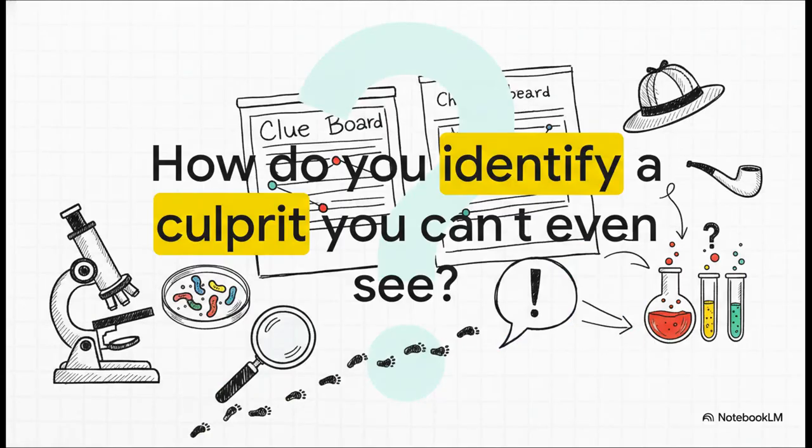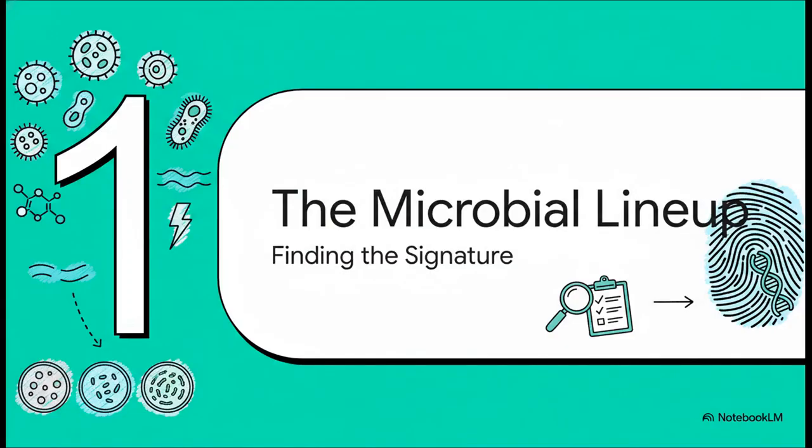And that very question is what turns the microbiology lab into a kind of detective's office. We're going to follow the clues and see how scientists use a series of really clever tests to basically force a microscopic suspect to confess its identity. You see, instead of a police lineup, scientists use a biochemical one. They put the bacteria up against different challenges, like here are some different food sources, or let's see how you do in this environment. And how the bacteria responds?